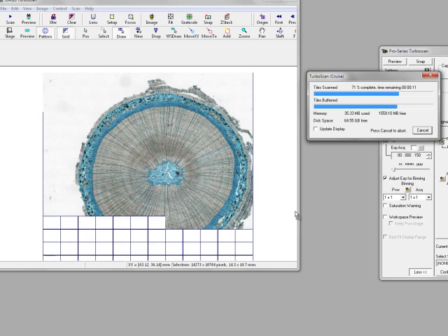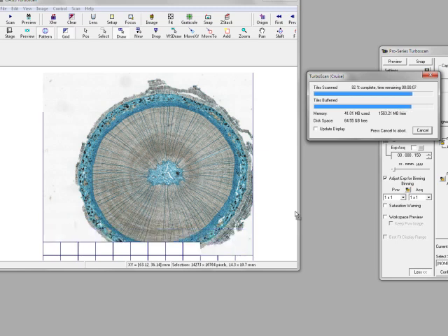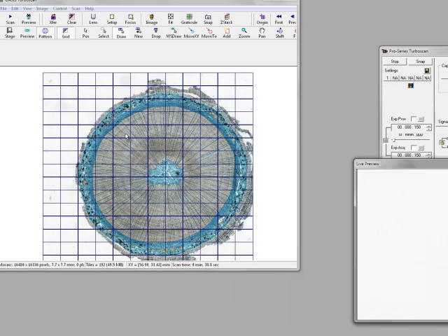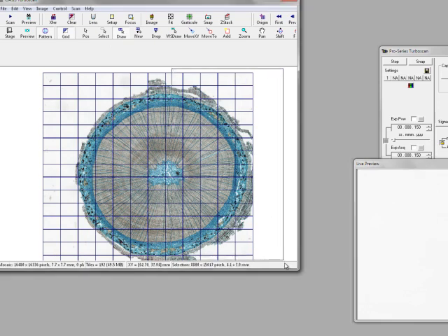So this is going nicely, and we can see we're taking quite a large area. So this is going to be a 14,000 by 10,000 pixel image. And one thing you can see, actually, that's nice and done, but one thing you can see is I've actually missed a little area. So maybe what I'm going to do now is I'm going to draw that slightly bigger, and I'm going to retile this area.